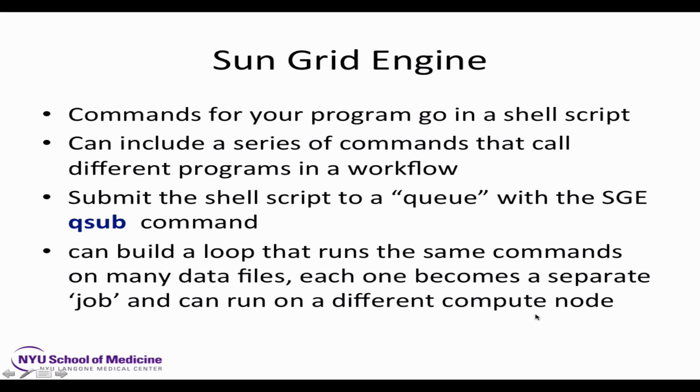We don't have a lot of data files today, but if you did have a lot of data files, you can write a little loop that submits multiple jobs to the cluster for each of your different data files. And I'm going to show you a little bit how to write an SGE script that could accept different files as input, so that you don't have to rewrite your script each time for each different data file that you're going to analyze. We're not going to run loops today, but I'll show you the structure that would support that.